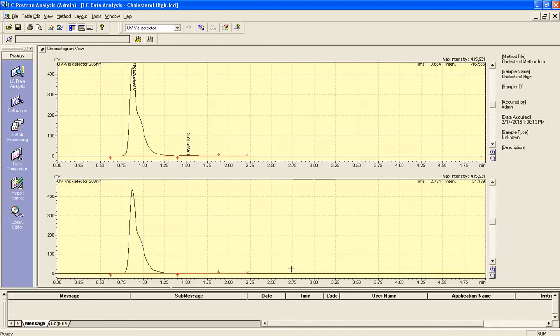Again, it shows mainly one large peak, and that large peak is symbolic of one component. The issue that I've got, though, is this wobbliness that happens here at the end. We call this peak tailing. So the tail end of the curve is a little wobbly. That means I'm not really picking the best mobile phase, and I'm not really picking the best stationary phase for this setup. So that's something in method development world that I would want to go back and maybe clean up a little bit to make sure that these peaks don't take this wobbly looking tail.